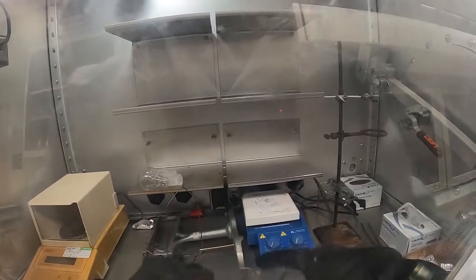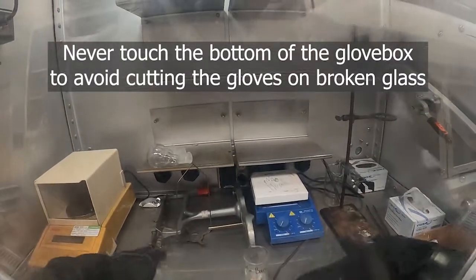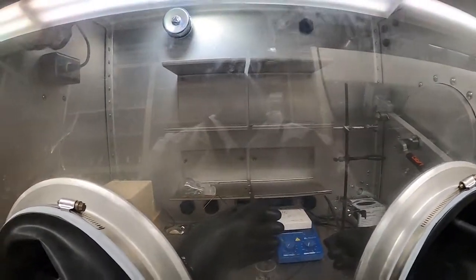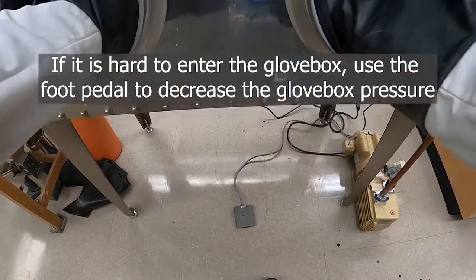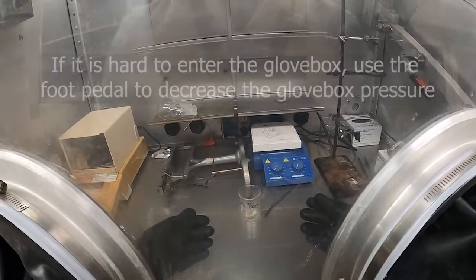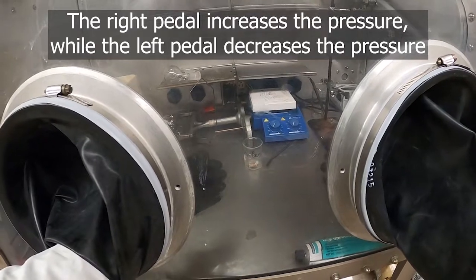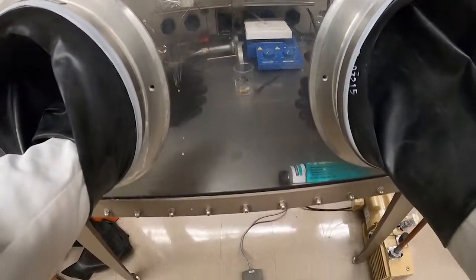These gloves are kind of delicate, so be careful — don't use anything sharp and watch out for broken glass. It's important not to touch the bottom of the glovebox, as that's where broken glass and other sharp things might be, and you can also get the gloves really dirty that way. For adjusting the pressure, there's a pedal on the floor: the left pedal decreases the pressure while the right one increases it. If you're smaller, you may want to decrease the pressure to get your arms in easier.